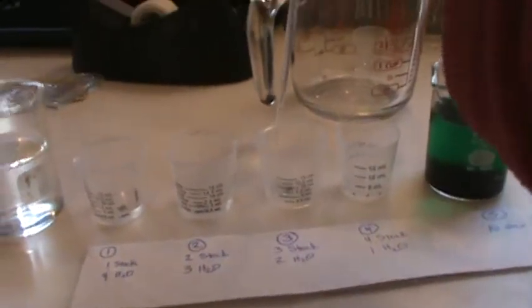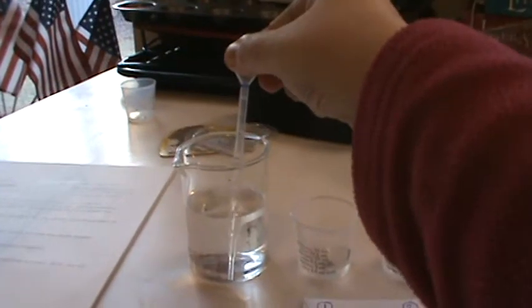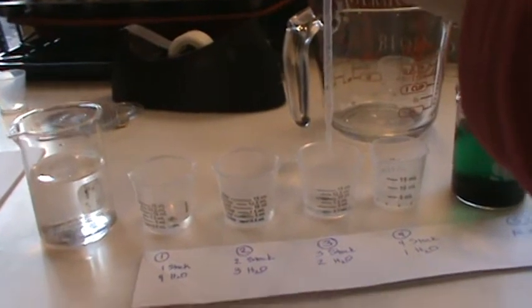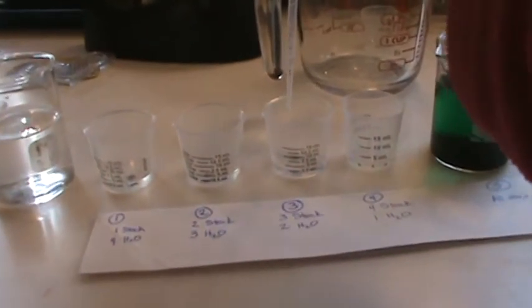All right, and now in solution 3, we're going to put in 2 milliliters. 1, 2. And then in solution 4, we will put in just 1.